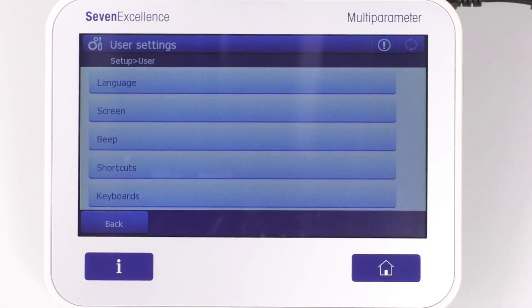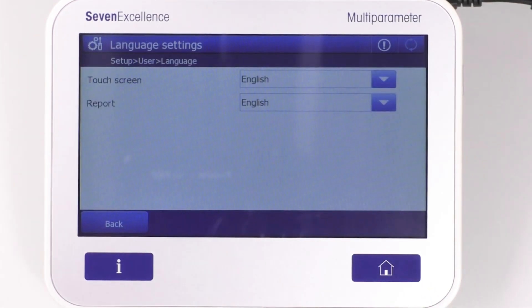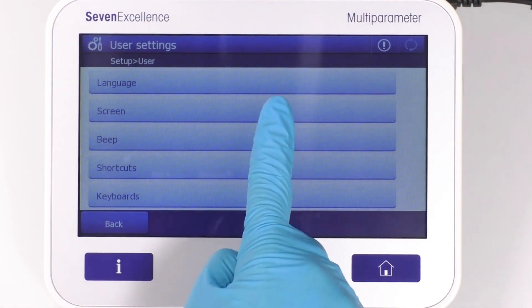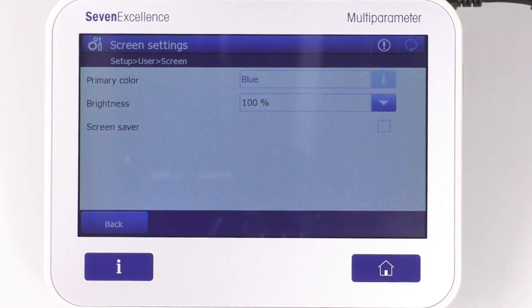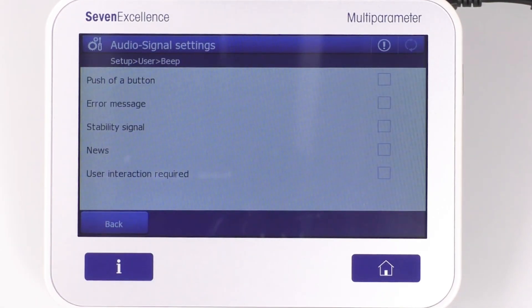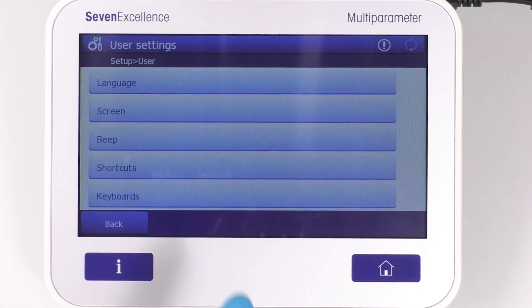Here you will find all the user-related options consolidated in one menu. You can select the language of the touchscreen and select the report. Screen settings offer the ability to adjust screen brightness and set screen saver settings. In the beep option, sound signals for different actions performed on the meter can be activated.